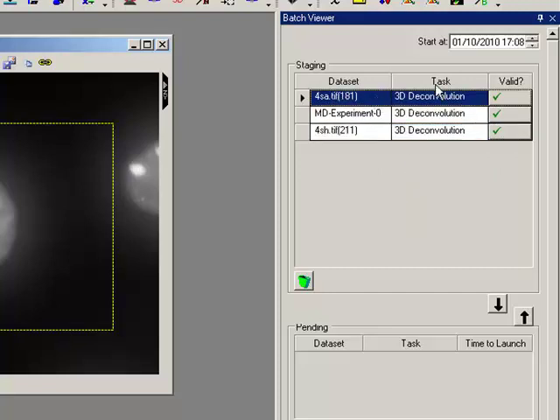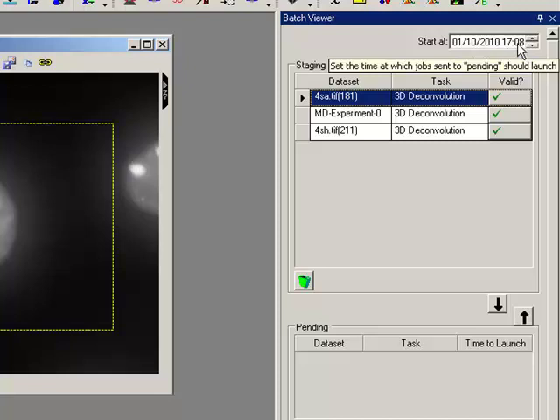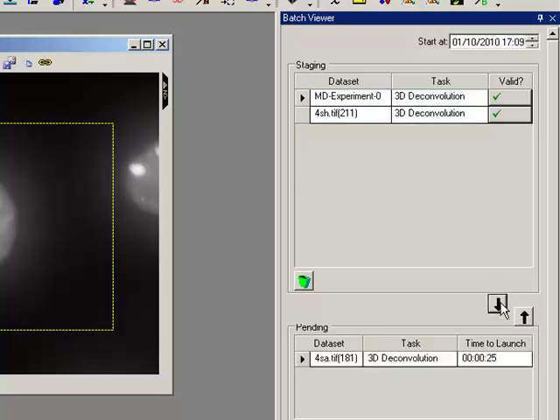So what we have to do now is set a time. We're going to say we're going to start in a couple of minutes, so it's the 10th of January today, 17:08. I'm going to say start at 17:09 and click this arrow here to send it to the pending area. And now we have the time to launch, 22 seconds.